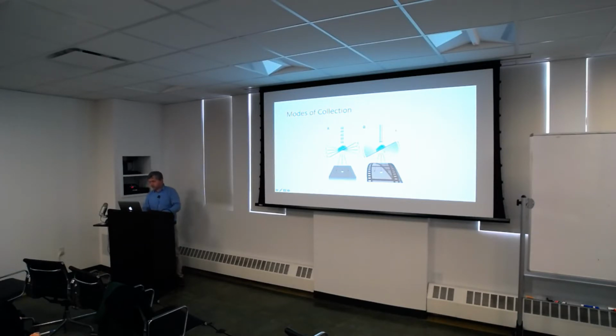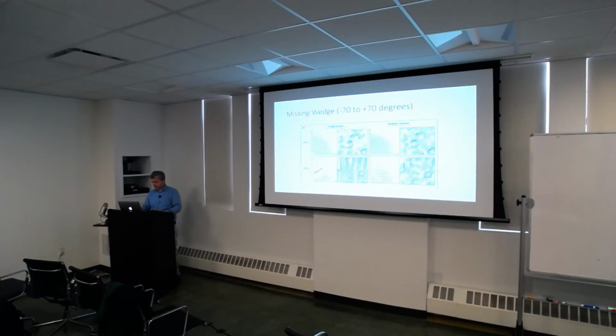This was the original experiment, and this is more what's done now. You have to have a camera that is fast enough to collect these movies, and a stage that lets you continuously rotate or tilt your sample at a defined speed. Those are the main 2 complicating factors for that.